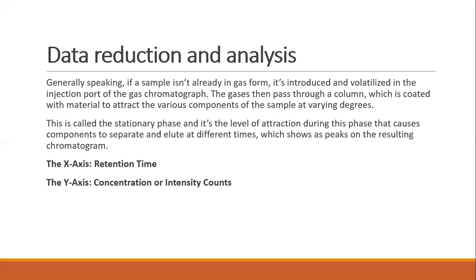This provides a spectrum of peaks for a sample, representing the analytes present in a sample eluting from the column at different times. Retention time can be used to identify analytes if the method conditions are constant. Also, a pattern of peaks will be constant for a sample under constant conditions and can be used to identify complex mixtures of analytes. However, in most modern applications, the gas chromatograph is connected to a mass spectrometer or similar detector that is capable of identifying the analytes represented by the peaks.